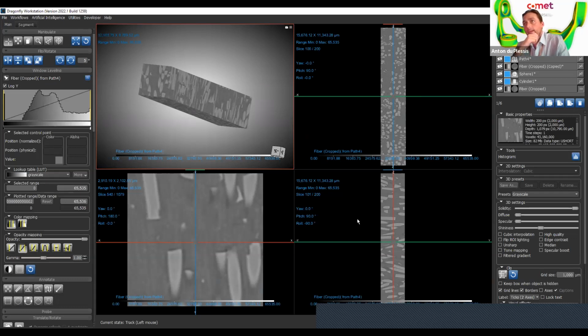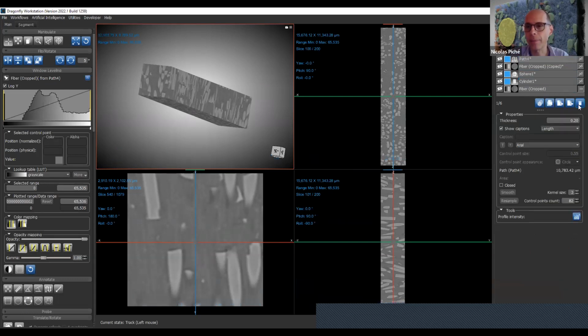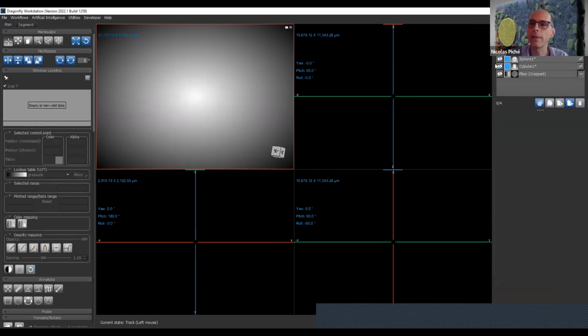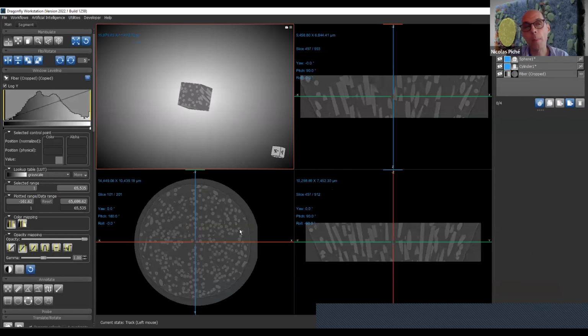Maybe I'm misunderstanding, but can you choose that path in 3D, like going through your slices, or do you need to rotate to the oblique way? No, I didn't talk about something interesting that I forgot and someone mentioned to me, because I'm the one who coded that part, but I had forgotten that I was able to do that: when you're in the MIP mode, when you click and put a point, it will go to the maximum intensity.